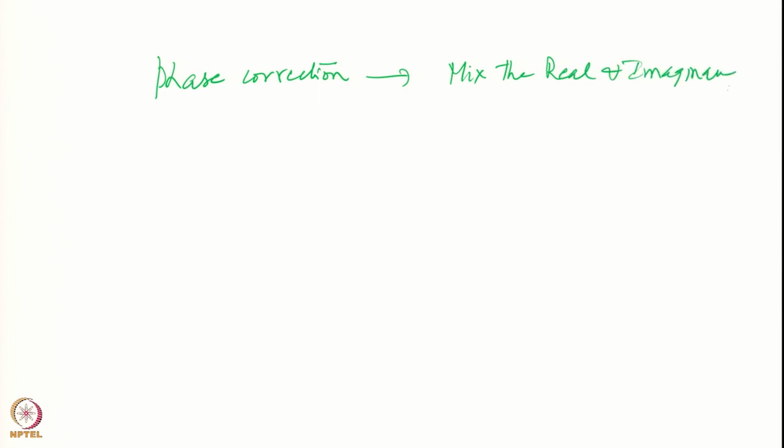Therefore phase correction would imply mixing the real and imaginary parts appropriately to eliminate the admixture.